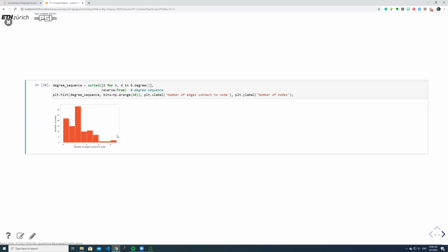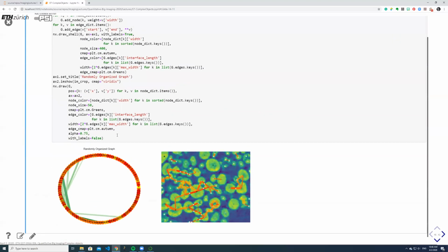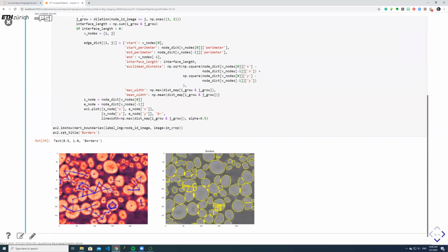So going back to this slide again, this is a single 2D image sliced out of a 3-dimensional object, and it's only used now to visualize how you can use watershed segmentation in 2D.